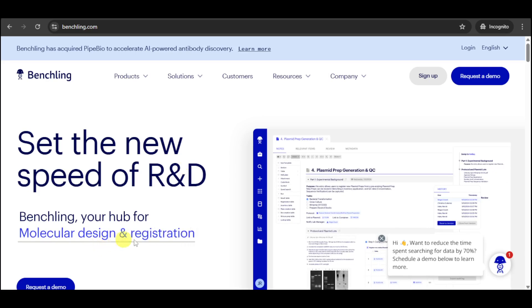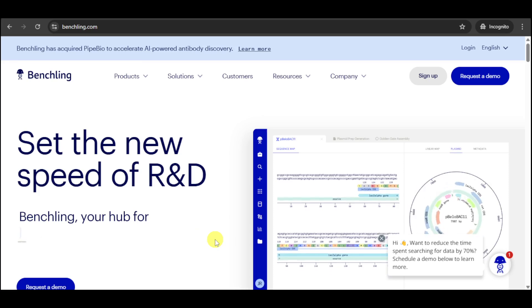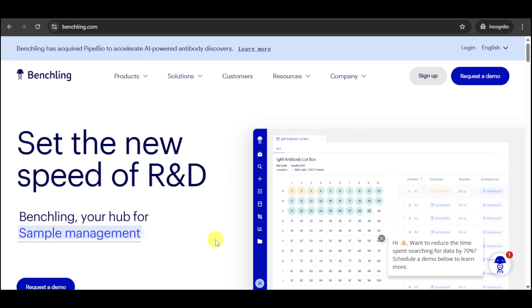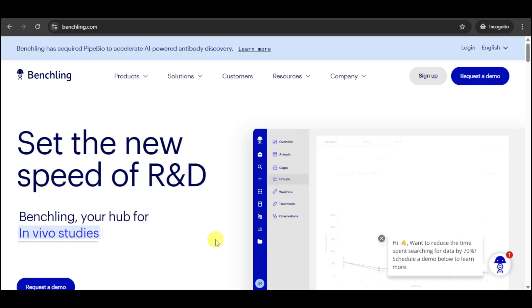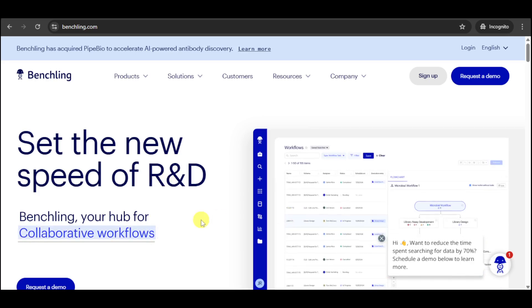BenchLink is a unified platform for modern life science R&D, designed to help scientists accelerate their research, collaborate more effectively, and make data-driven decisions. And you can get started for free.